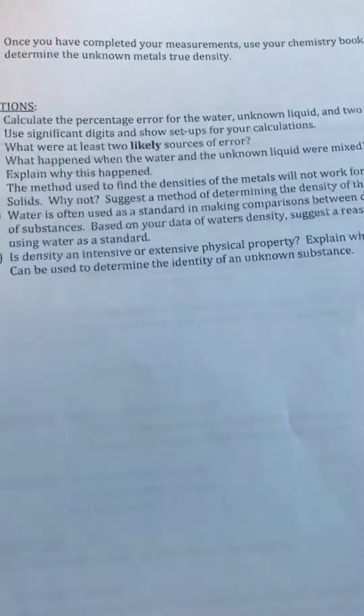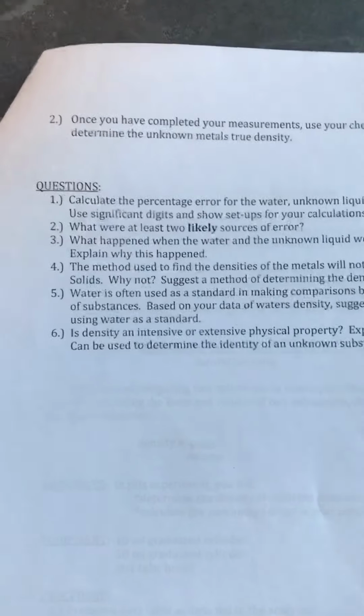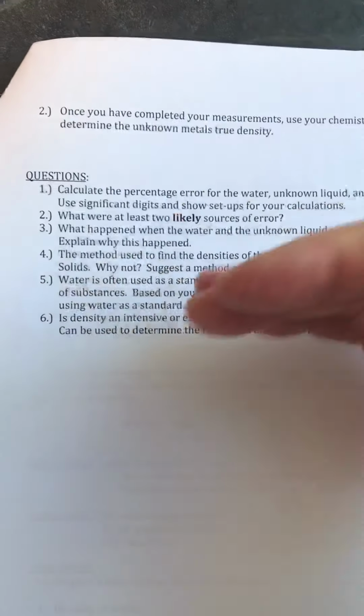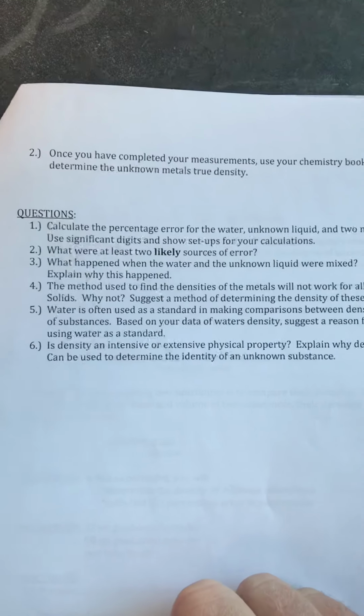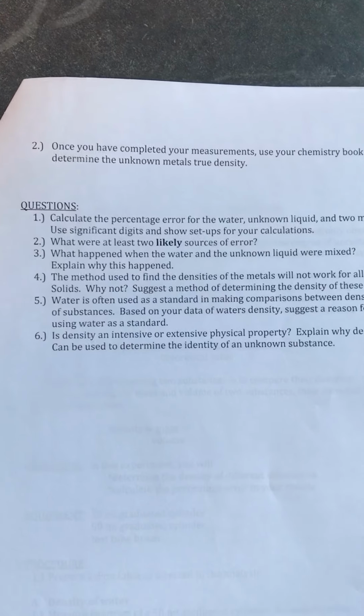Now, I also was getting the density of water, and you might have noticed I did not go to a distilled water distributor. I just used tap water. I wonder, could that make a difference? All right, then go ahead and answer those questions. Now, two likely sources of error. I've actually kind of given them away in this lab. I won't do that again, though. I would have gotten away with it, too, if it wasn't for you meddling kids. All right, and then answer the other questions.